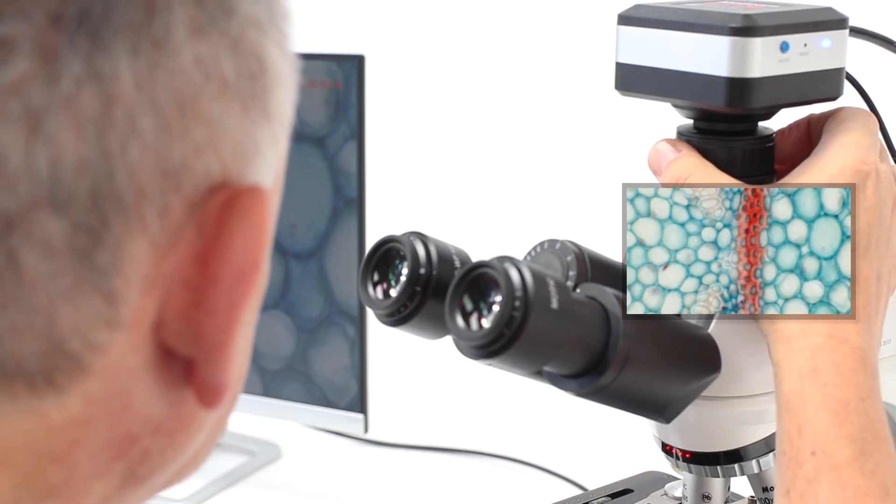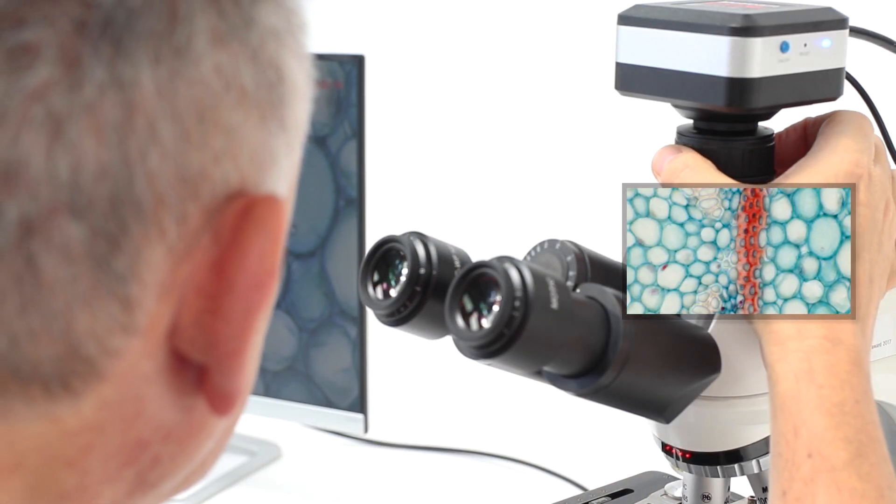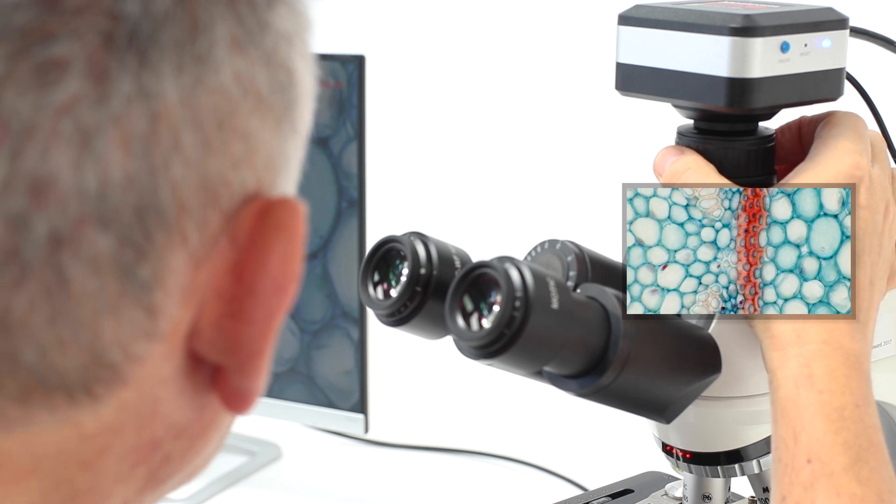Next, view the live image on your external device and adjust the focusable ring on the C-mount adapter until the image is sharp on the screen.